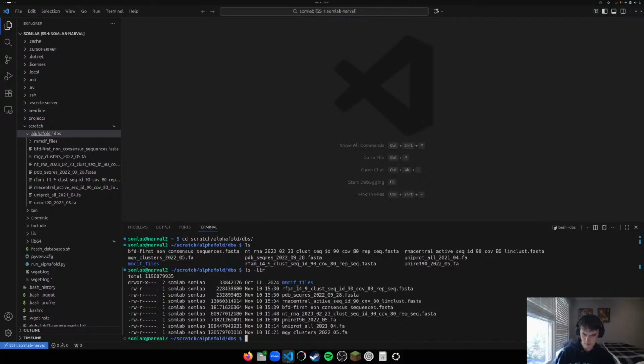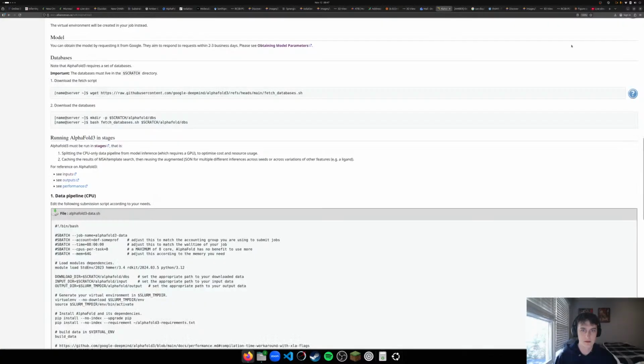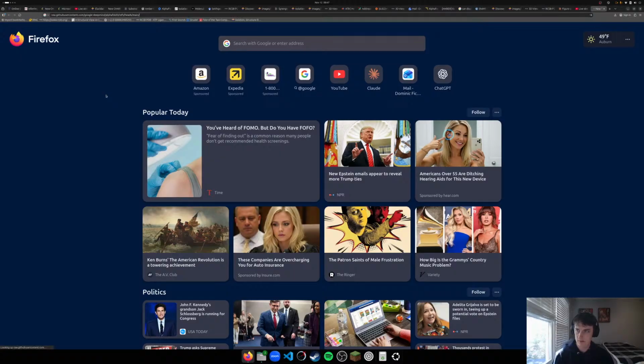So basically what we're going to have to do is, where are we at? Here. So this was the fetch databases.sh. So let's look at this.